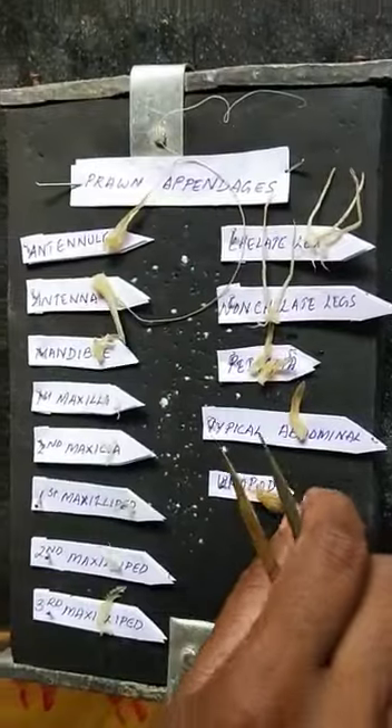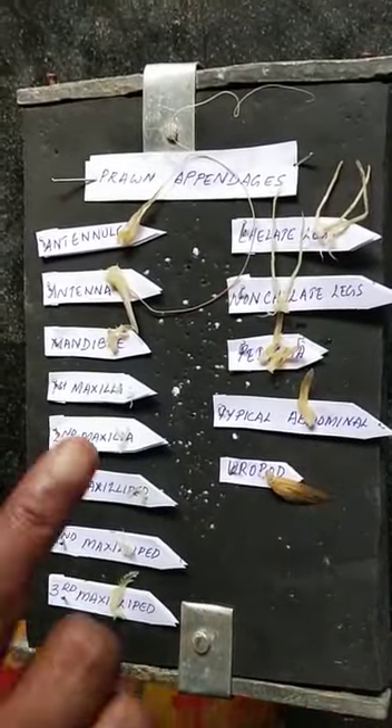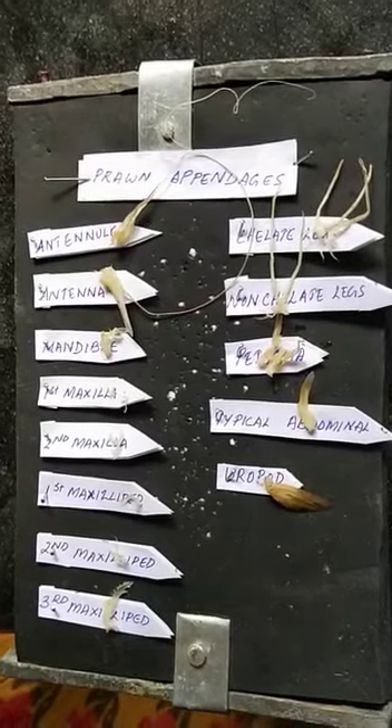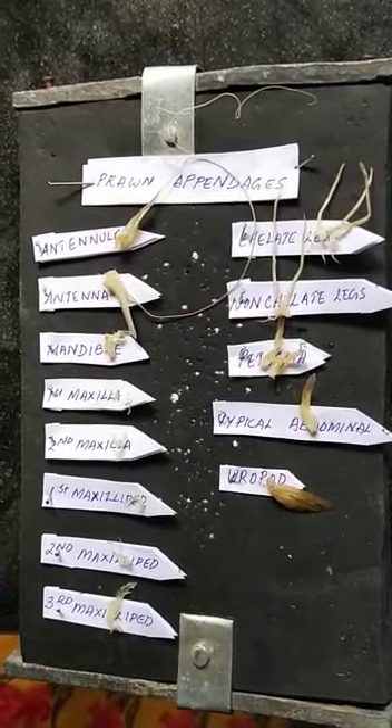The uropod is the last appendage. This crustacean has five cephalic appendages, eight thoracic appendages, as well as six abdominal appendages.